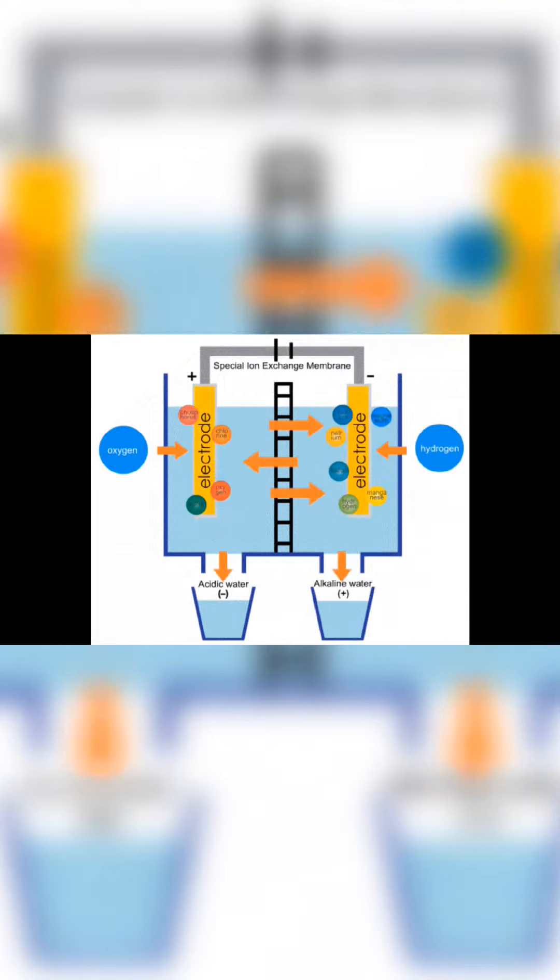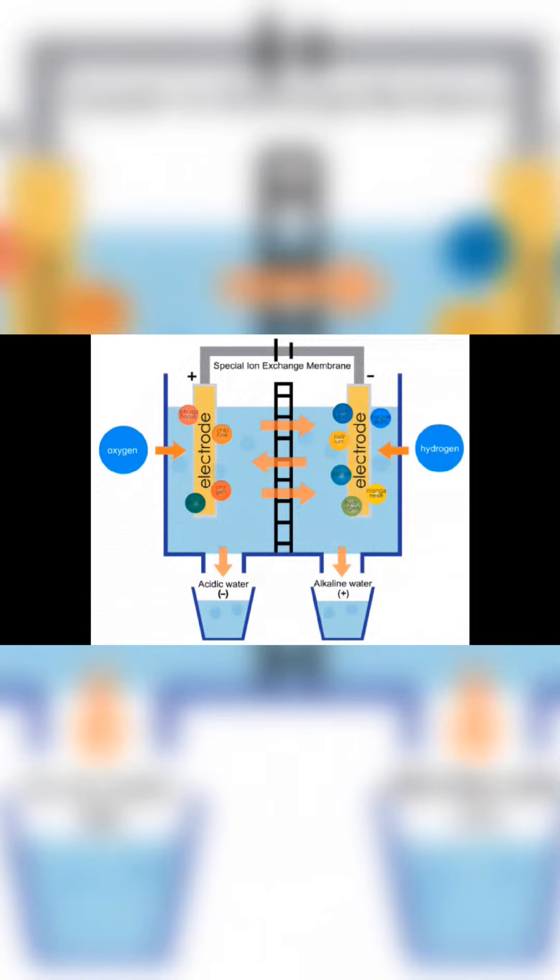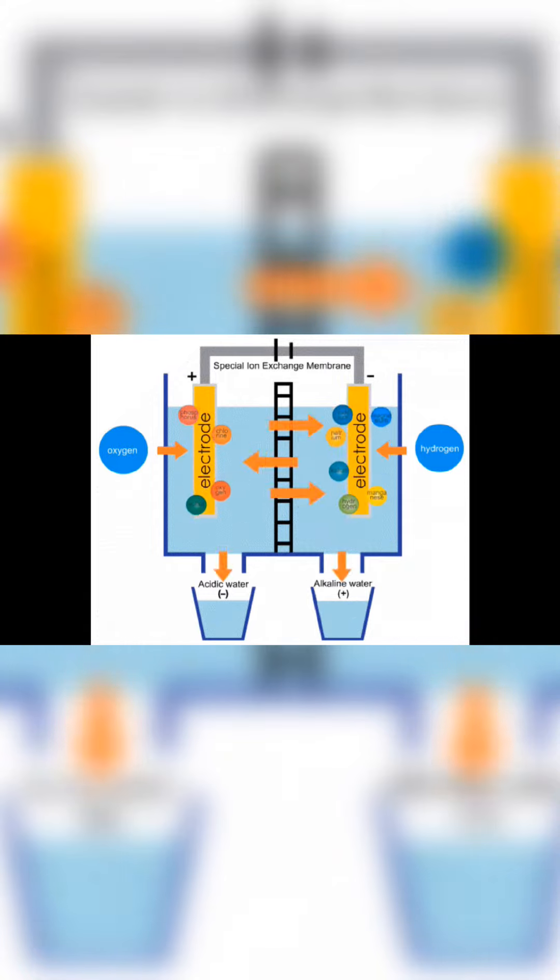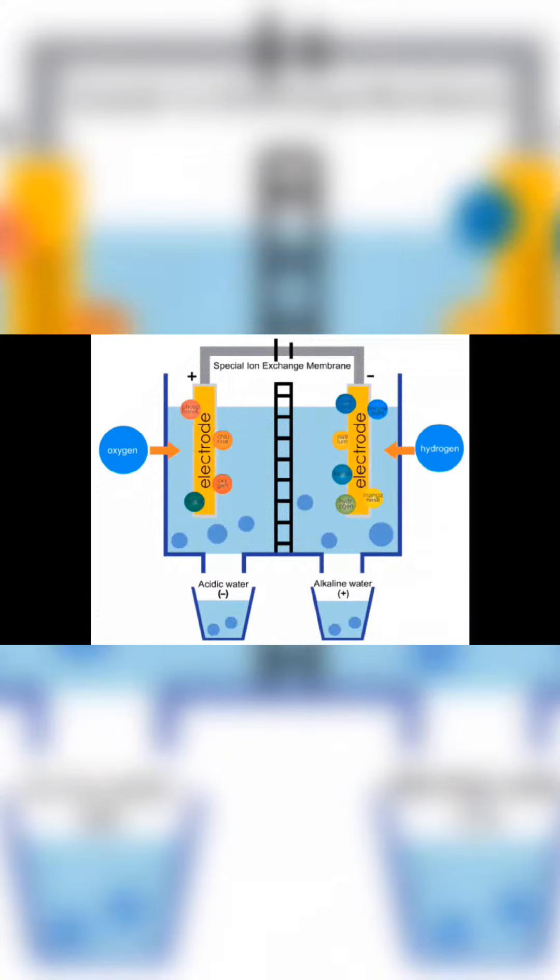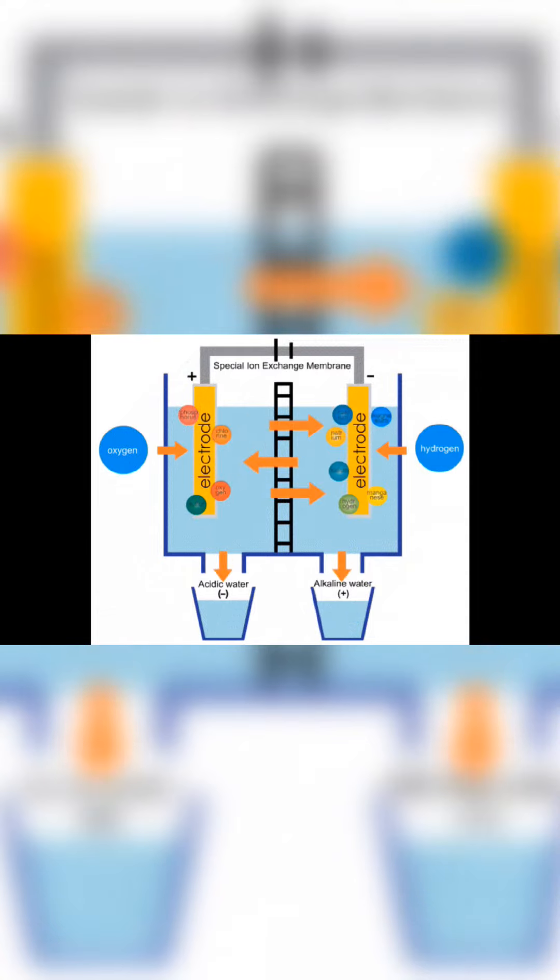You should see copper forming on the electrode connected to the negative terminal. The copper from the solution is getting deposited. Meanwhile, the electrode connected to the positive terminal will show signs of corrosion.